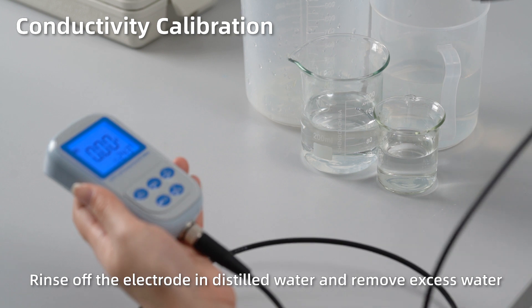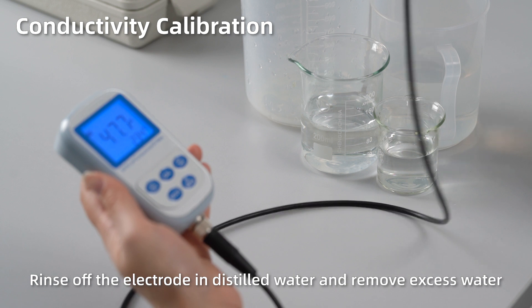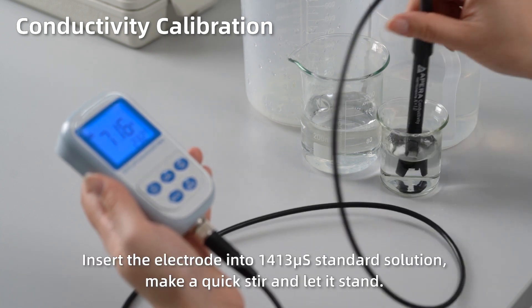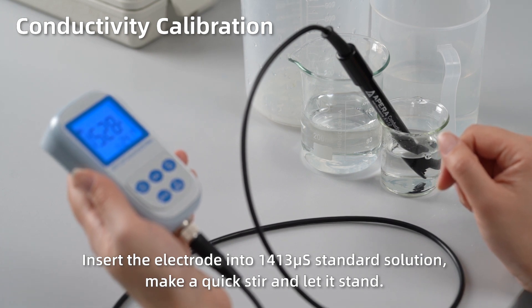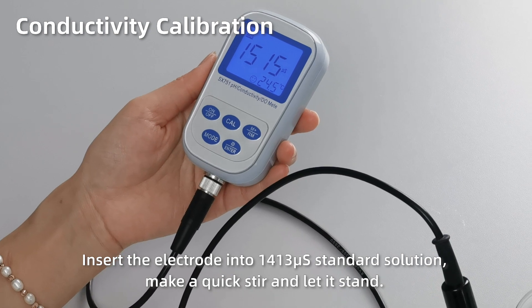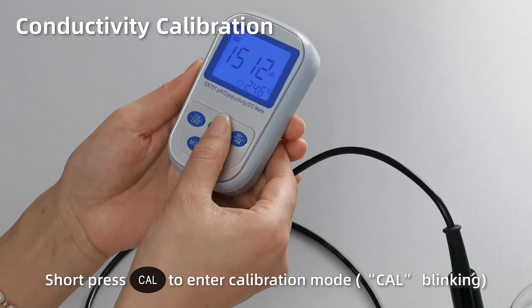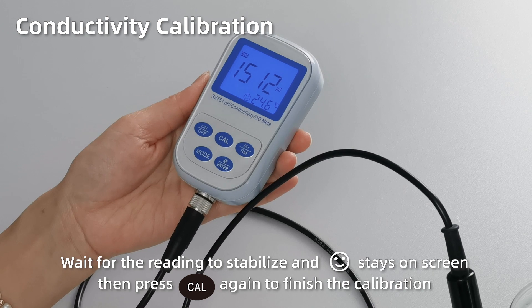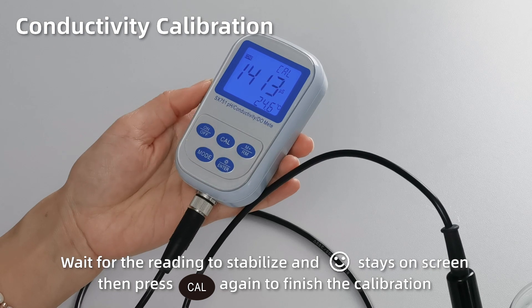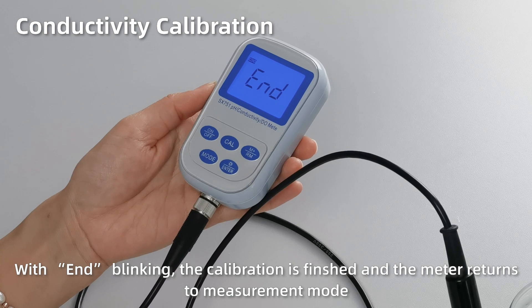Conductivity calibration. Rinse off the electrode in distilled water and remove excess water. Insert the electrode into 1413 µS/cm standard solution. Make a quick stir and let it stand. Short press Cal to enter calibration mode. When the reading gets fully stabilized and the smiley face stays on screen, press Cal again to finish the calibration. With 'End' blinking, the calibration is finished and the meter returns to measurement mode.